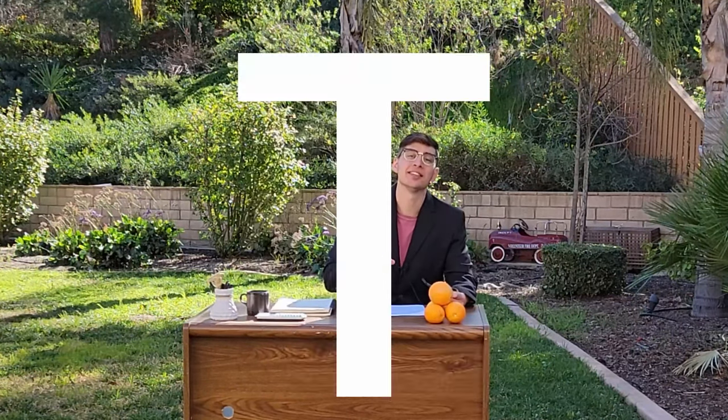Hi, welcome to the DIY Biotech Writing Workshop. Today we'll be writing in the code of life — A's, C's, T's, and G's. Our project is to produce cinnamon compounds in yeast by integrating the genes that will make those compounds.